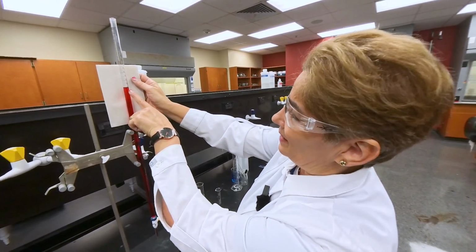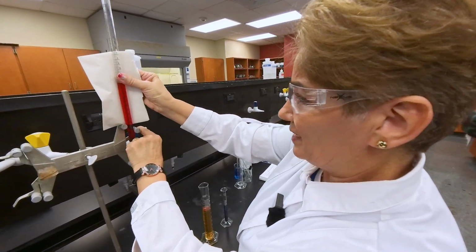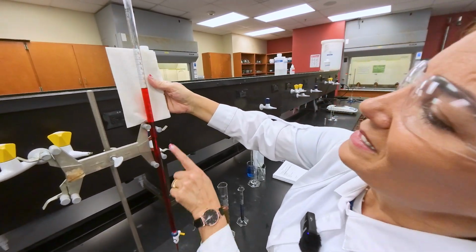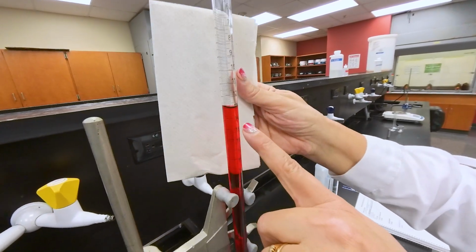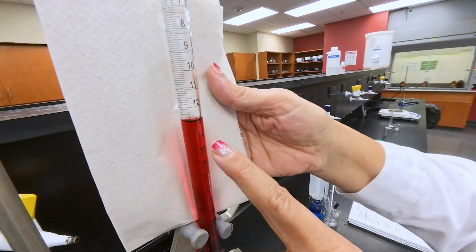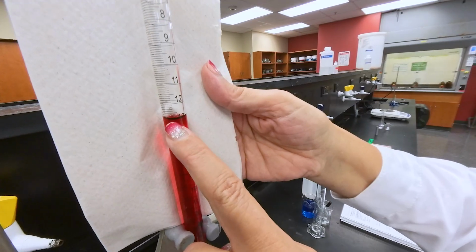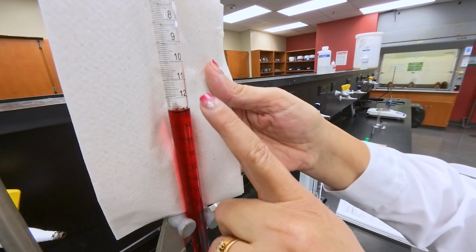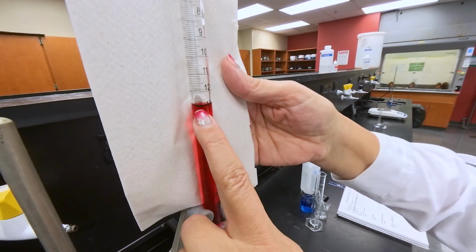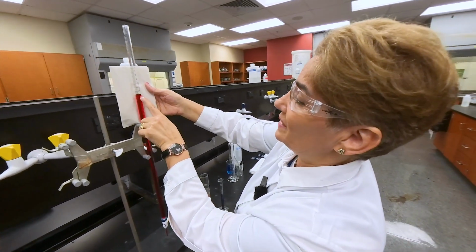So what is the level now? I have to adjust the level to bring it to my eye level. So I bring it down, making sure that it doesn't hit and break the base here. This number is between 12 and 13, but the numbers are increasing downward. You already know that each small line shows 0.1, because between 12 and 13 I have 10 spaces, so it's going to be between 12.9 and 13, and you are going to estimate that exact number using the still shot.